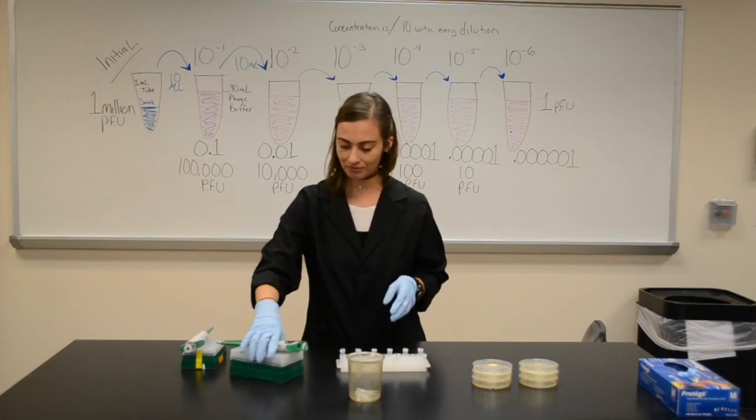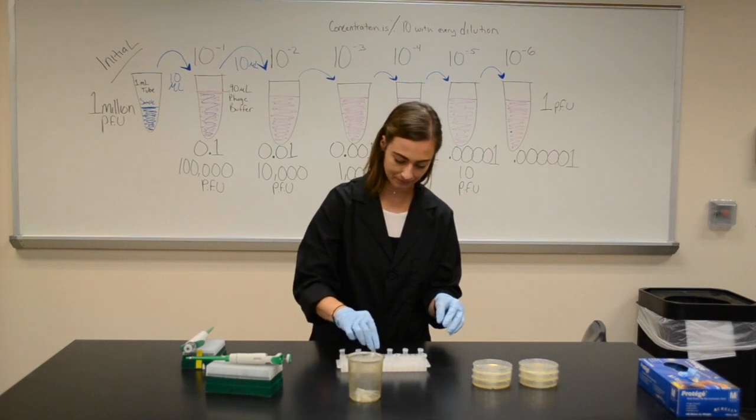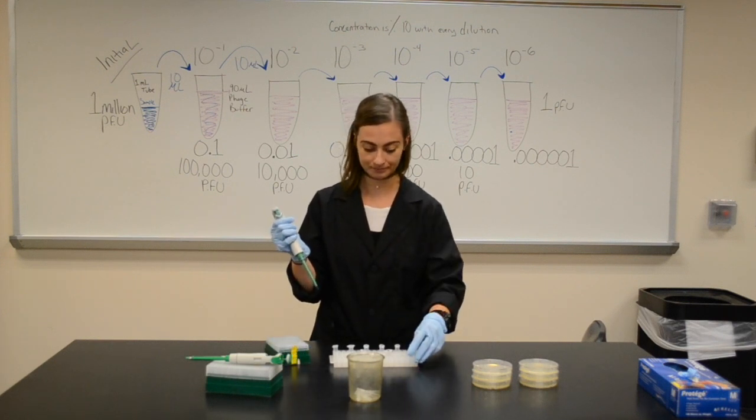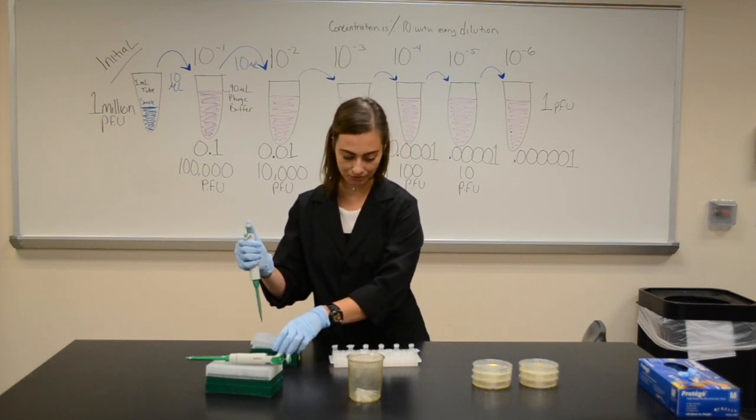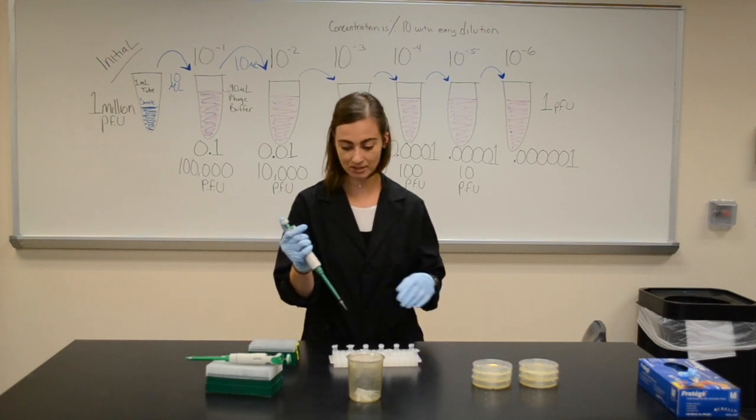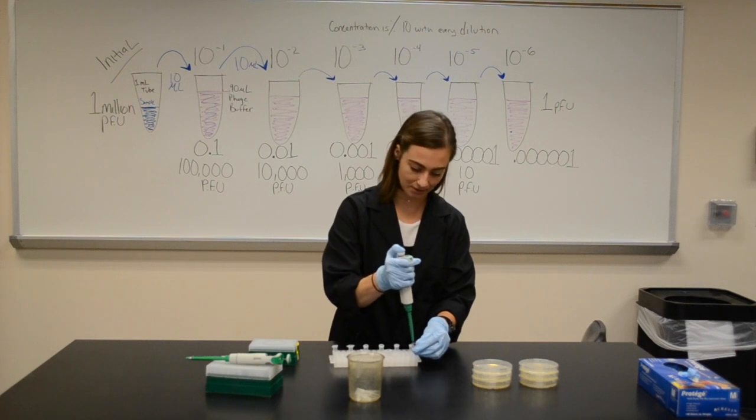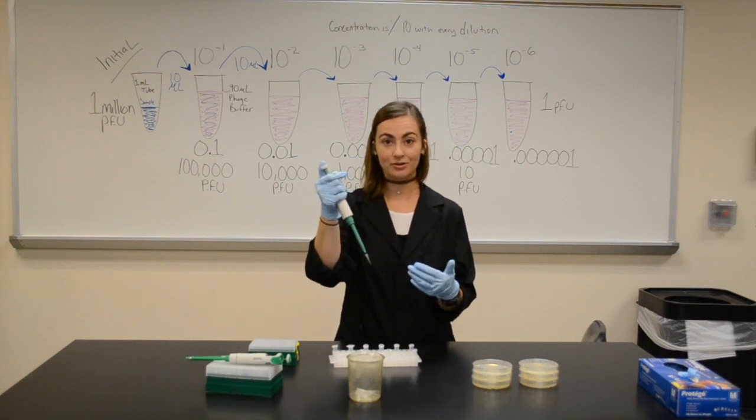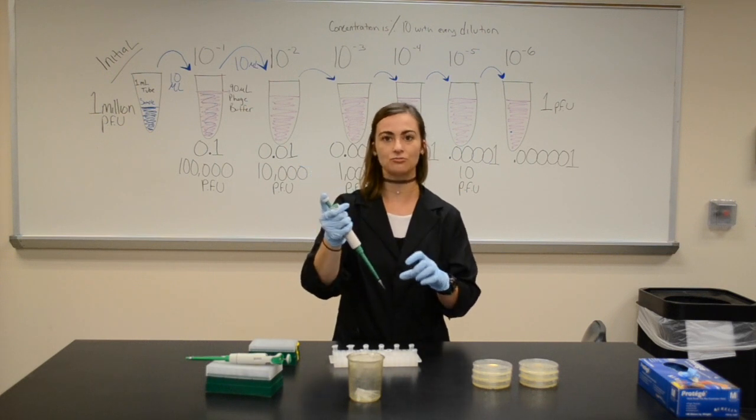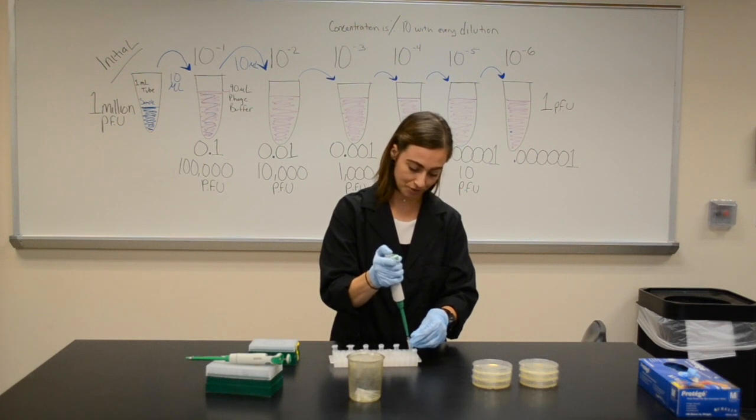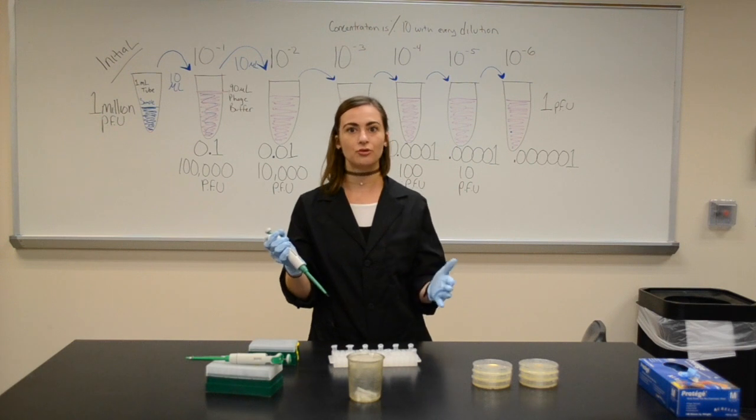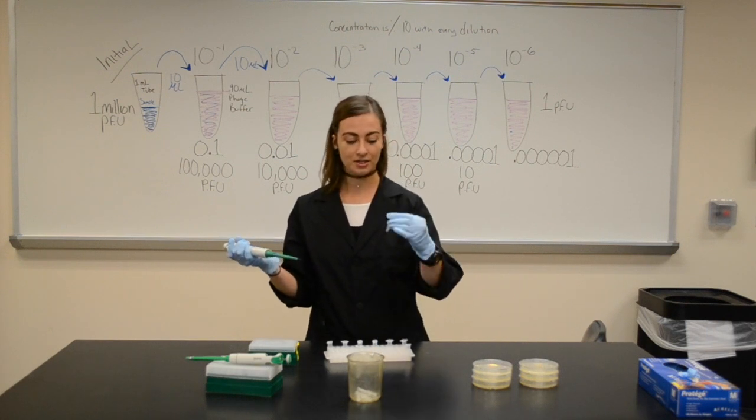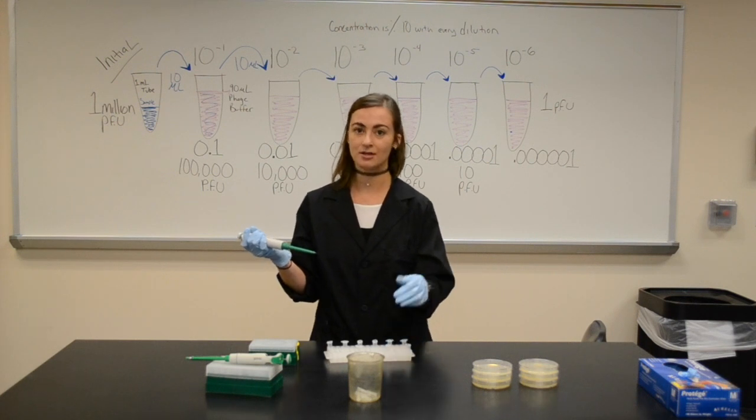Now that everything has 90 microliters of phage buffer, I'm going to take my 10 microliters of my sample and put that into the first dilution. I've checked the pipette, it's on 10, and I'm going to go in here. If only my camera could magically zoom in, you'd be able to see that 10 microliters is really small. Once you squeeze it out, it may even only look like a little drop, less than a teardrop. I think 3 microliters is a teardrop, so imagine 10. You almost have nothing. And one of these containers actually holds a milliliter, so that's a thousand microliters. 10 microliters is really small.